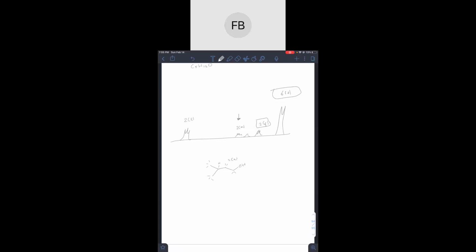So I think, because he said the 2 multiplet, I don't really get that. I think he meant 1 multiplet, because it's kind of hard to see what's going on there. I think I'm going to change this to 1 multiplet, because I can only see 1 multiplet. I couldn't quite figure out what the number was supposed to correspond to.